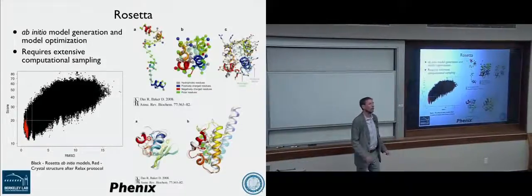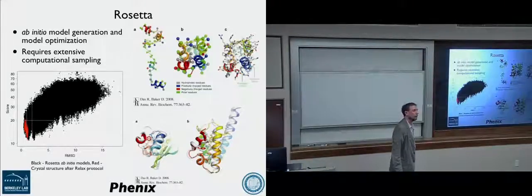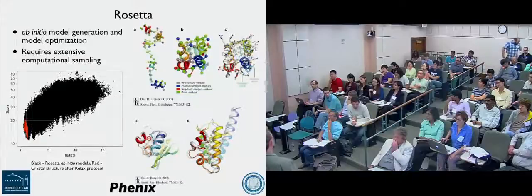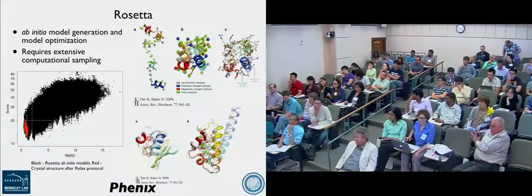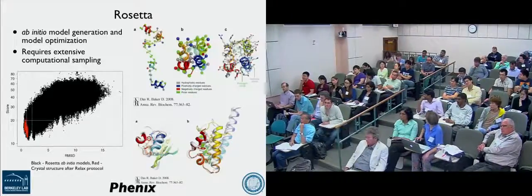So you mentioned, of course, for something 300 amino acids, you're not going to be able to do an ab initio prediction. But am I correct in thinking that if you believe you have a certain part of the structure that may be well modelable, you could model that part and use it to phase the rest? Depending on how much it is, but yeah, potentially.